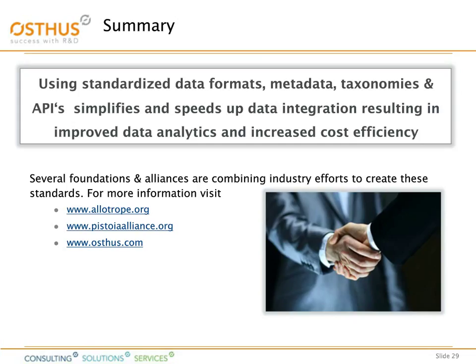So the main message which we want to give you with this webinar is that data integration projects become easier and faster if you use standardization. So I want to invite you to have a look at some of the alliances and foundations who are currently working on standardization within our industry. I've already mentioned Allotrope, but in this context, I also want to mention the Pistoia Alliance, which is already doing a lot of work on standardization. If you don't know them, have a look at what they're doing, or if you want more information, you can always contact us.